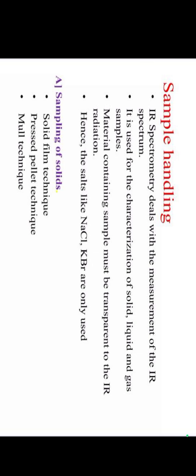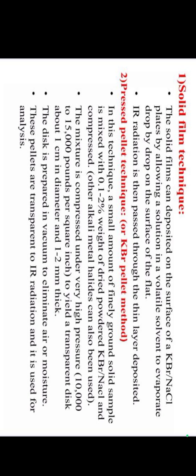In the solid film technique, the solid film is deposited on the surface of potassium bromide or sodium chloride plates by allowing a solution in a volatile solvent to evaporate drop by drop on the surface. IR radiation is then passed through the thin layer deposited. This is known as the solid film technique.